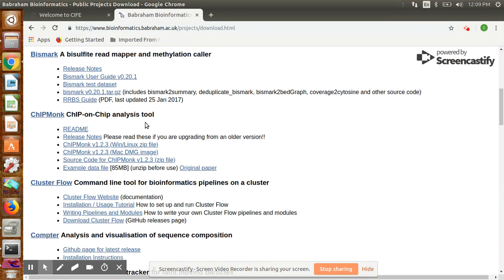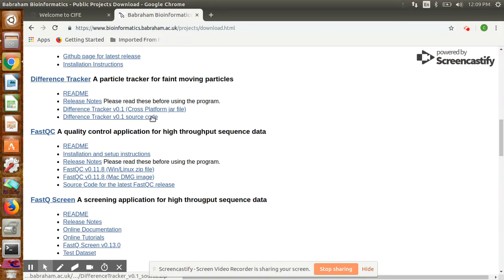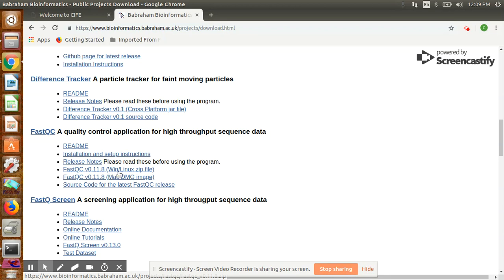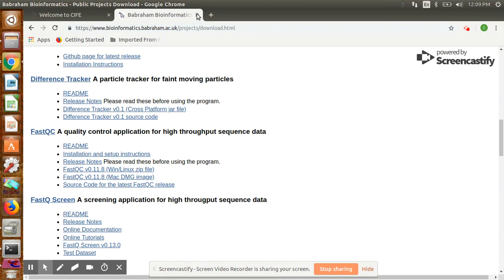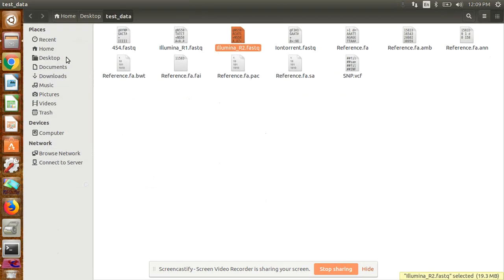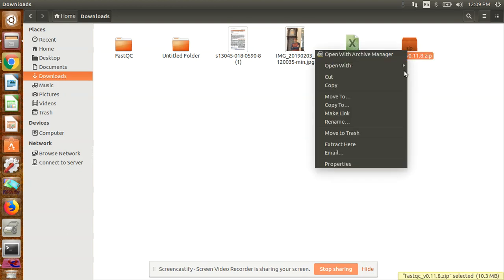Click on that, then scroll down and go to the download link. Here you can see the FastQC download link. You have to download this for both Windows and Linux systems. Click on it and it will start downloading.